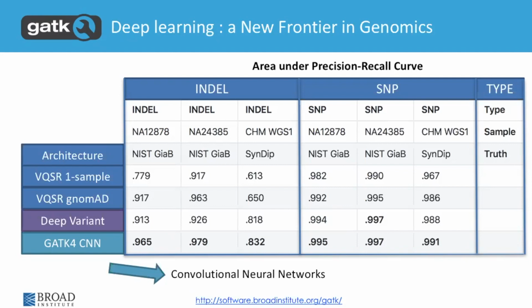So they haven't validated it yet. Theoretically, it should be applicable, but there's some work to do to test how the tools actually perform and evaluate whether there's any need to tweak to adapt the tool for the somatic case, or whether it should work as is. And that work has been started. But you were mentioning DeepVariant is not available for somatic samples. There has to be most likely a resolution for that.